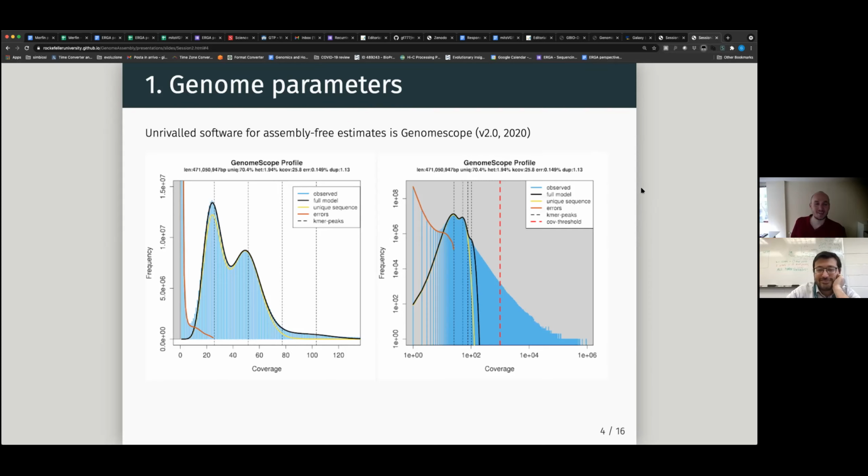So the haploid versus diploid peaks, can you infer based on the ratio the actual proportions of haploid versus diploid uniqueness, or because of all the stuff over on the right, is that going to really pollute your ratio?